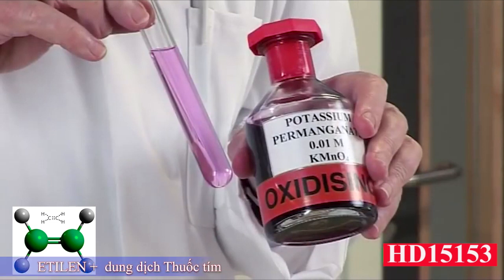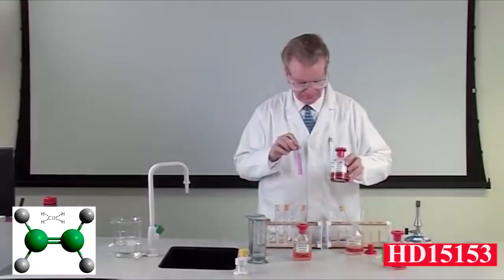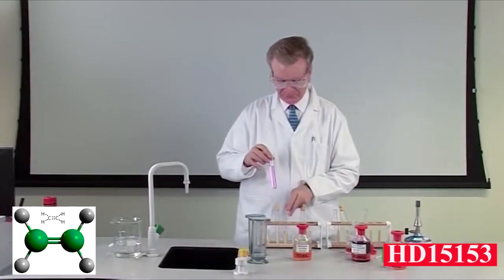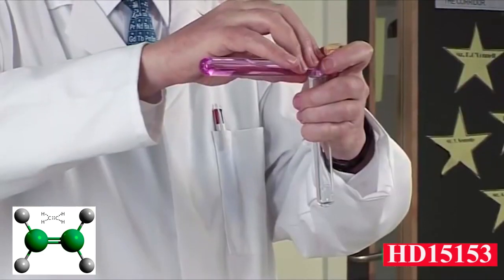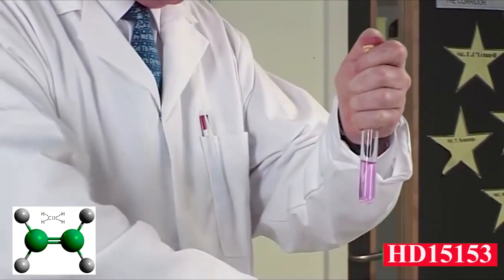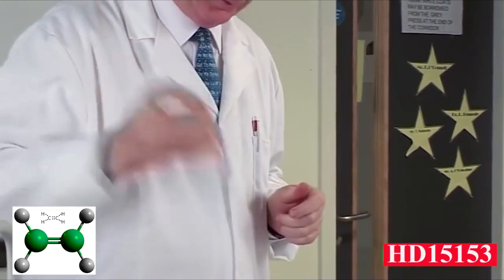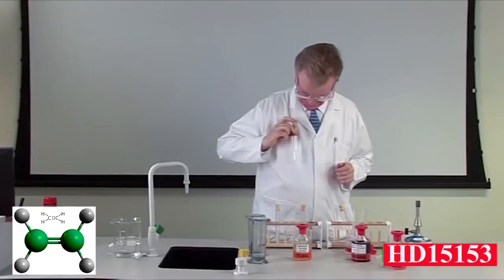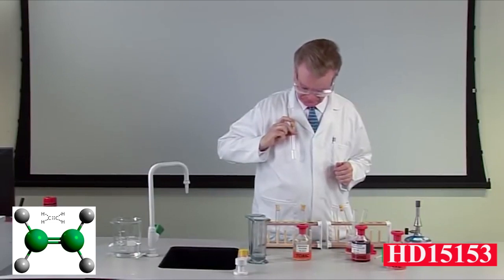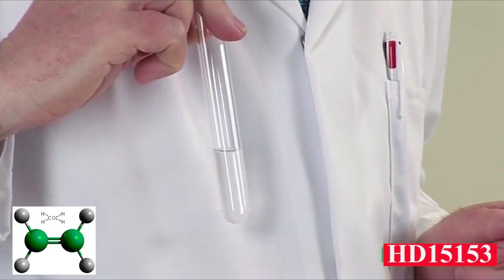Potassium permanganate, KMnO4, is also used to test for the presence of the carbon-carbon double bond in ethene. Add about 1/10 of a test tube of dilute KMnO4 to a test tube of ethene. Shake the test tube a few times. The disappearance of the purple color to give a colorless solution is evidence for the presence of a carbon-carbon double bond.